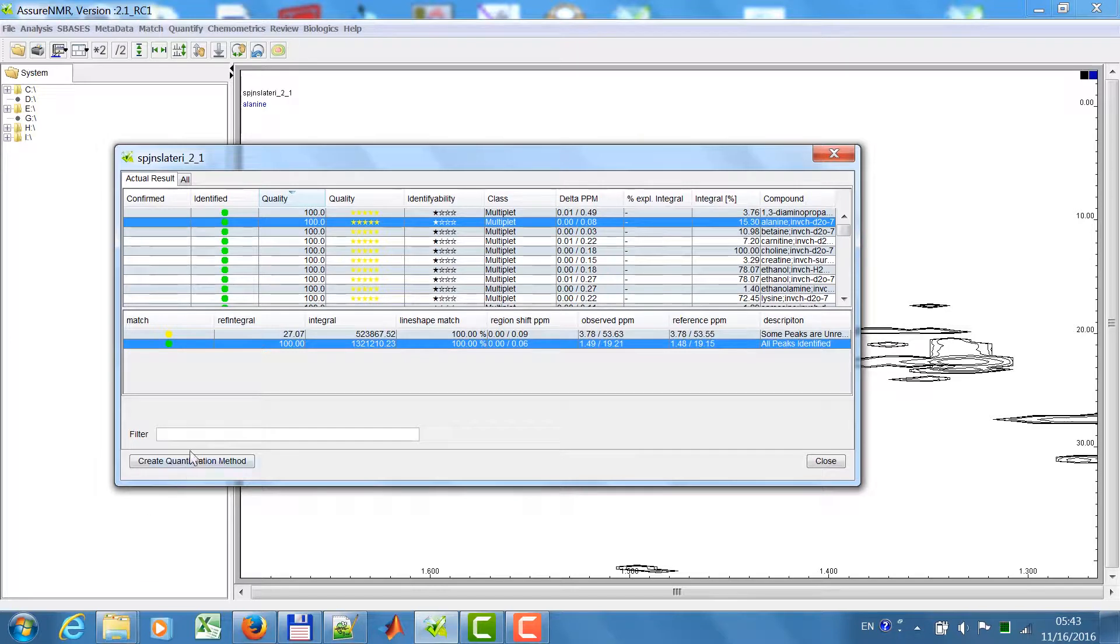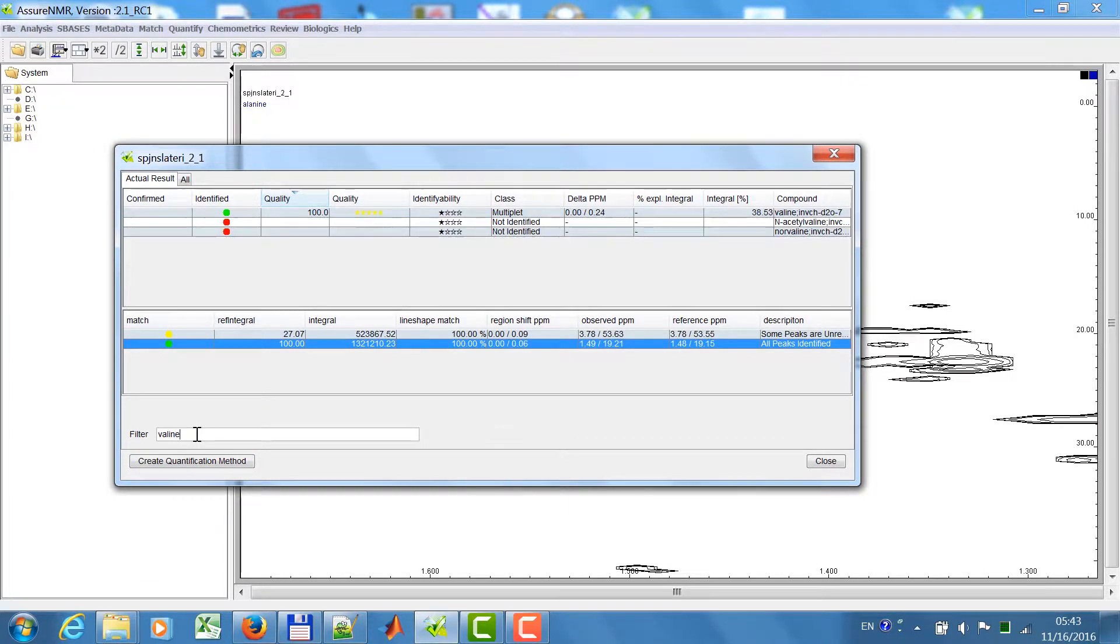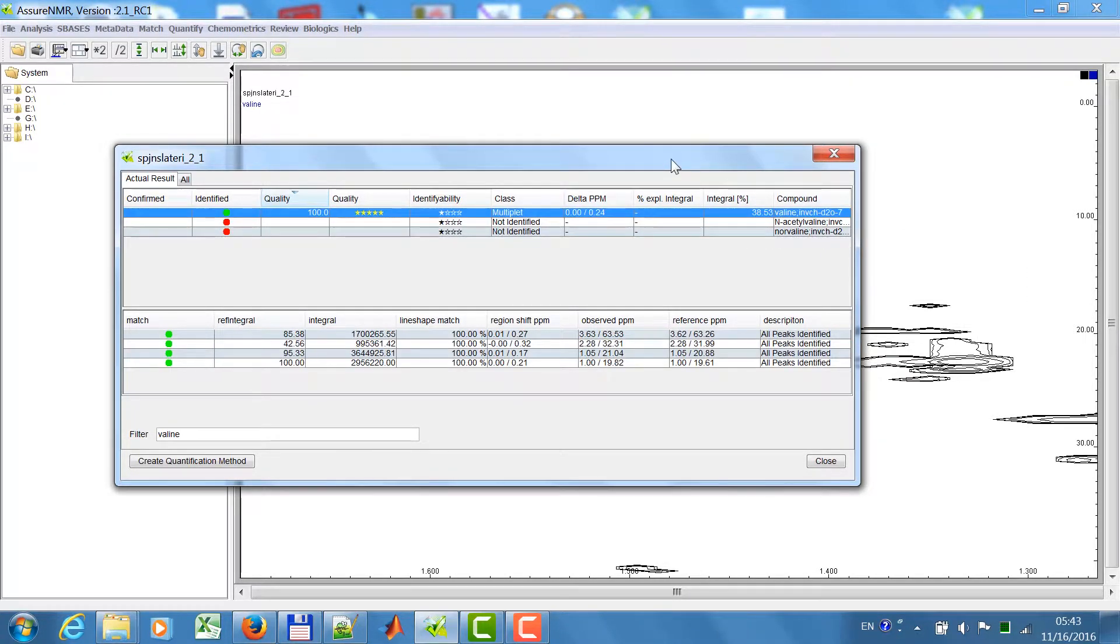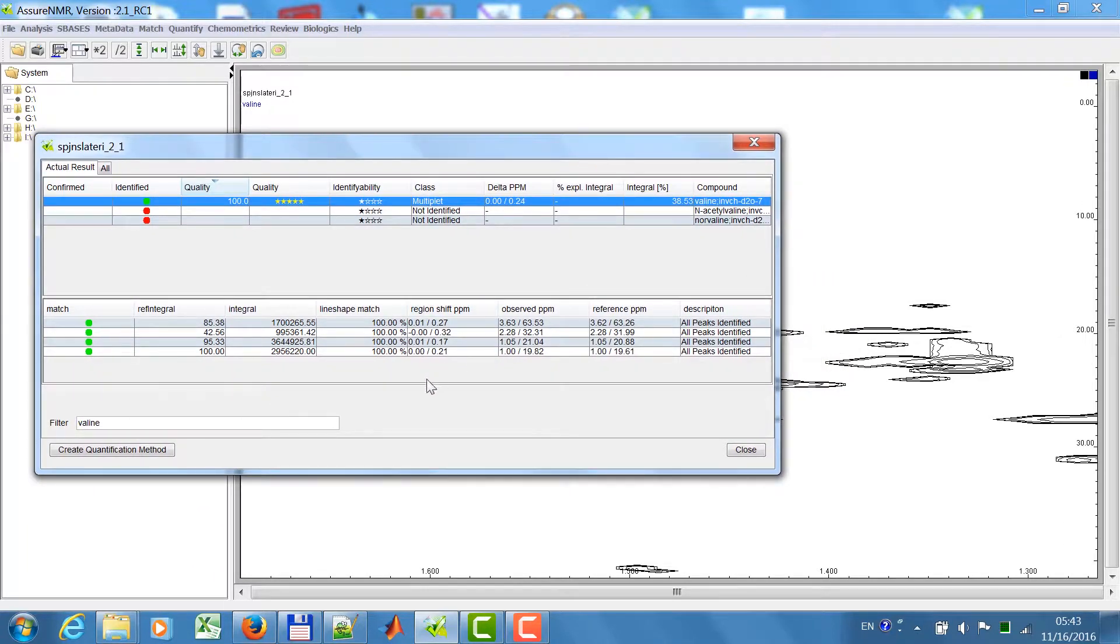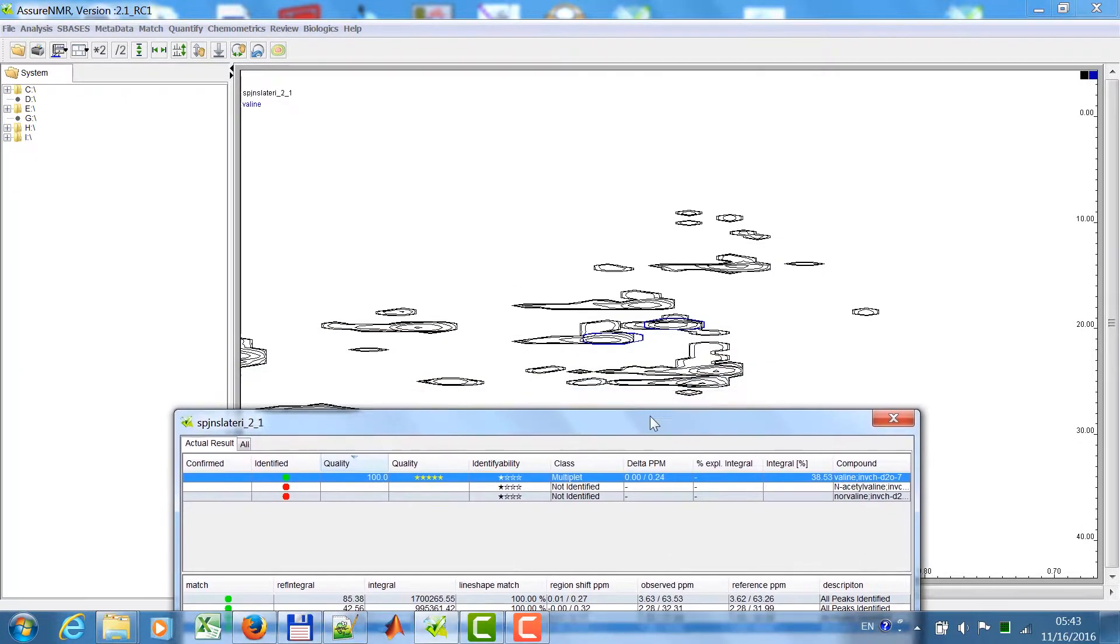If you are searching for a special compound, just enter filter. For example, valine here. All compounds which have valine in their name are listed. I click on this one here and then I select one of the regions and then you can easily see they are identified here.